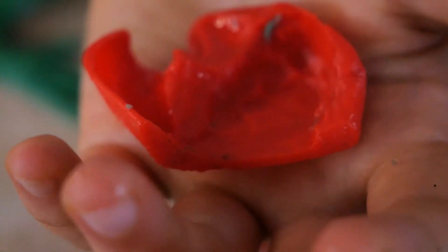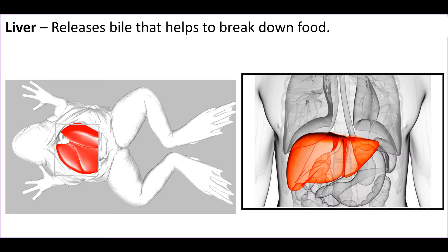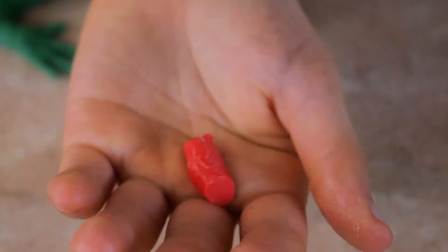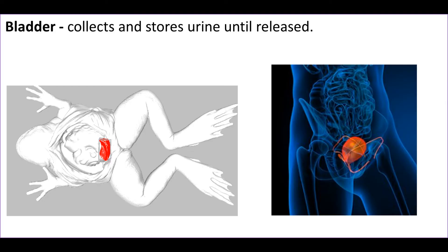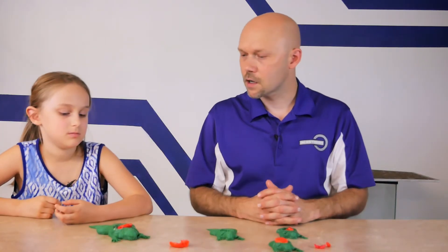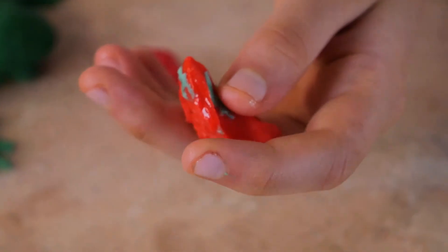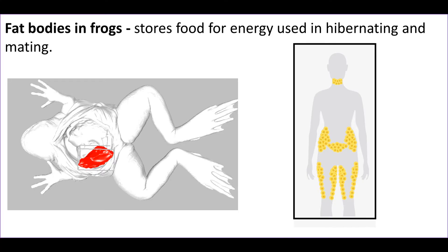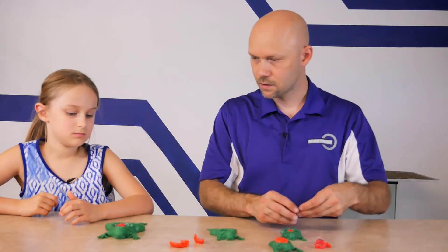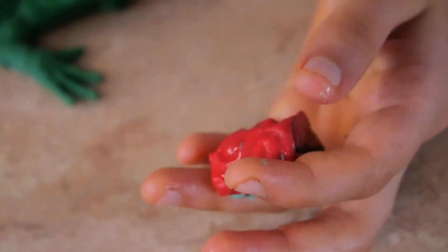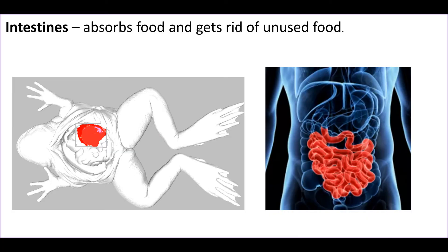The first piece is the liver. The liver releases bile that helps to break down food in a frog, just like it does in your body. Next is the bladder — just like in our bodies, the frog's bladder collects and stores urine until it's ready to be released. Then we have the fat bodies — in frogs these store food energy used during hibernation and mating. In our bodies, we store fat in cells throughout the body and underneath our skin. This large piece is the intestines — the small and large intestines — which absorb food and get rid of unused food, just like in our bodies.